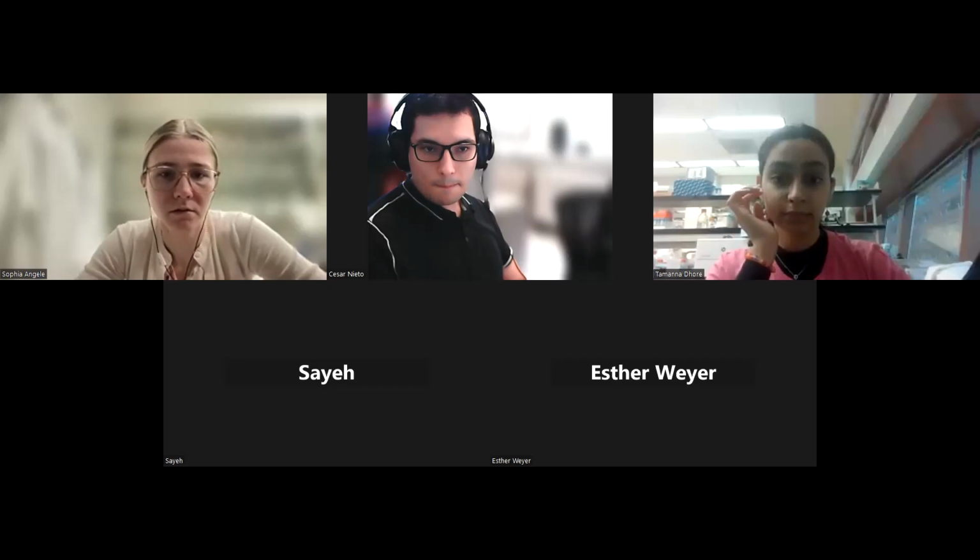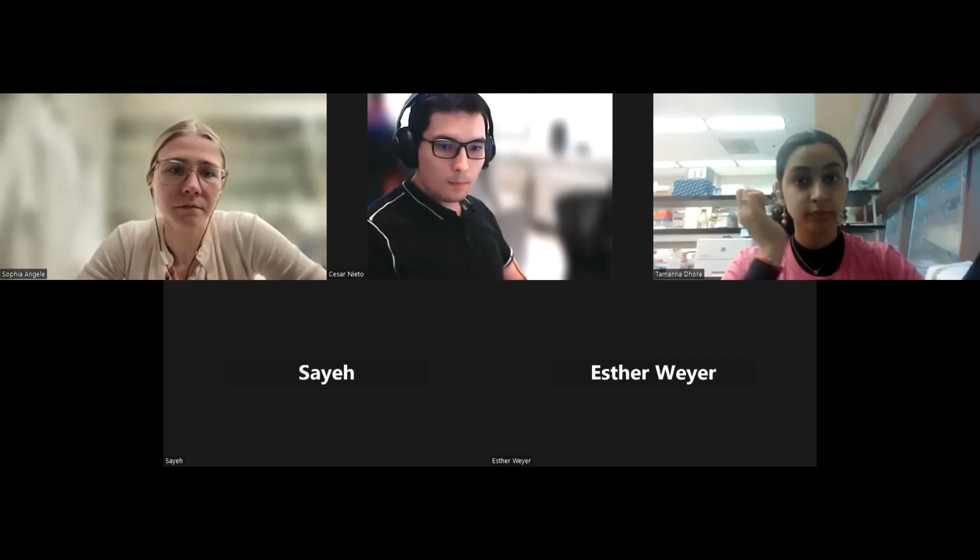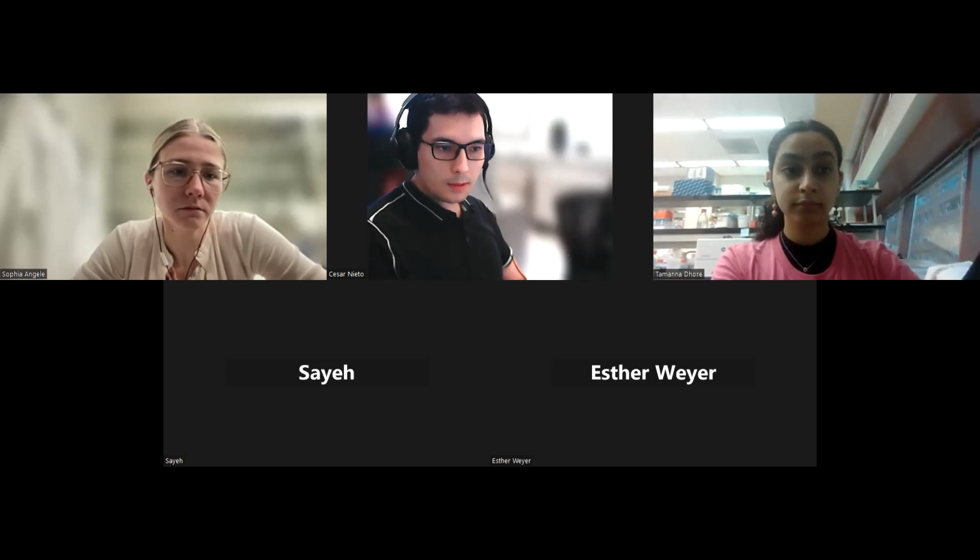Sure. Okay. Okay, I'm going to share my screen.